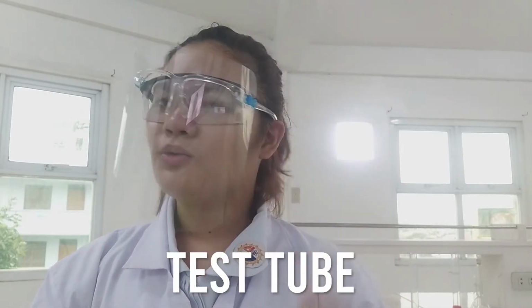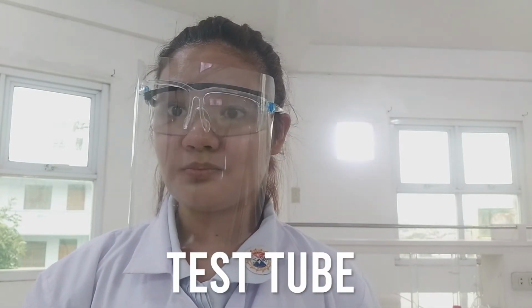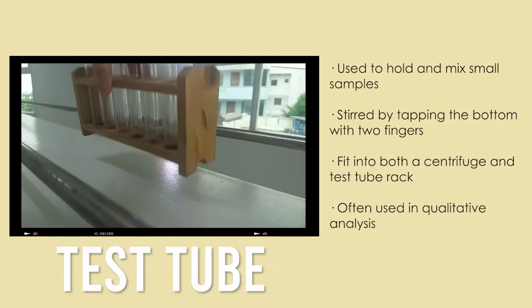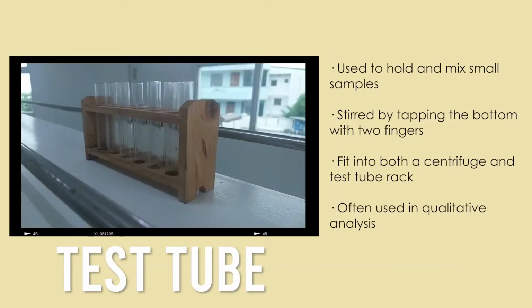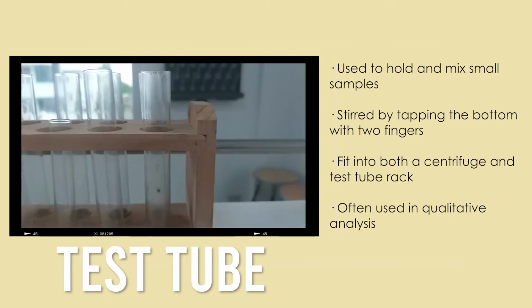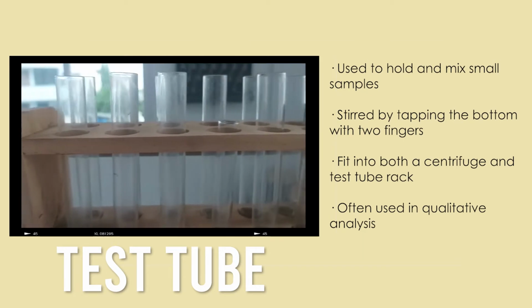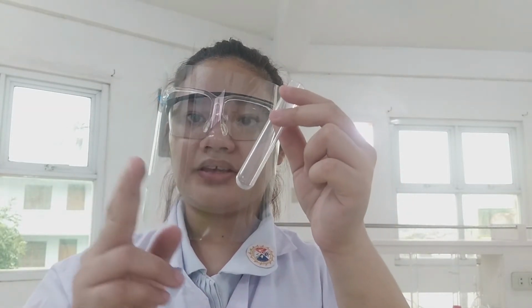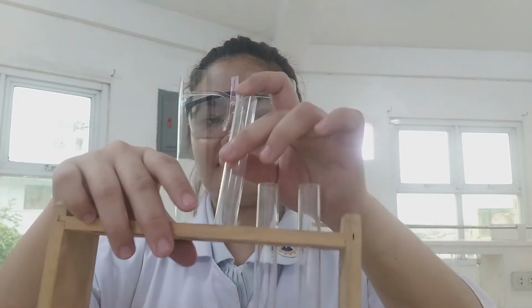Third in this category is the test tube. I mean, who doesn't know what the test tube is right now? Well, for all you crammers, a test tube is used to mix and hold small samples for qualitative analysis. It can be mixed by tapping the bottom with 2 fingers. It can fit both a centrifuge and a test tube rack.